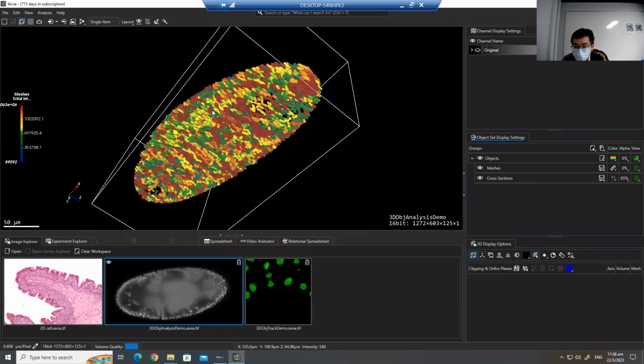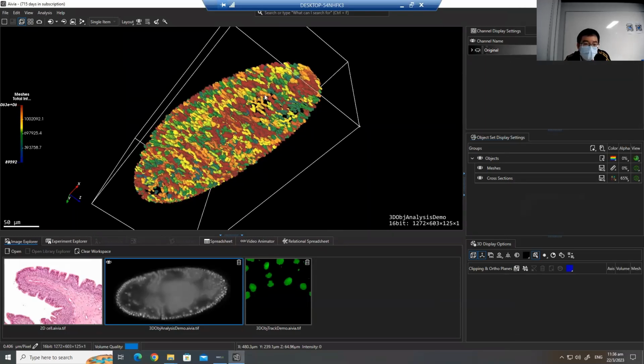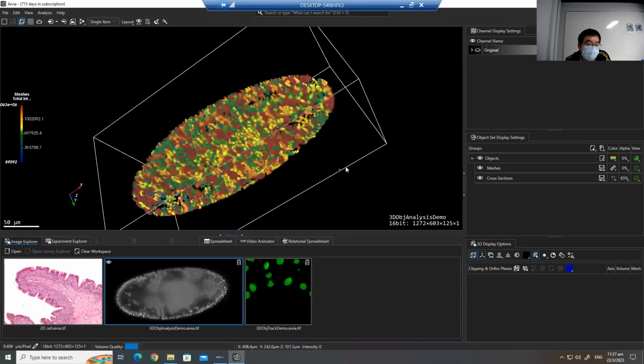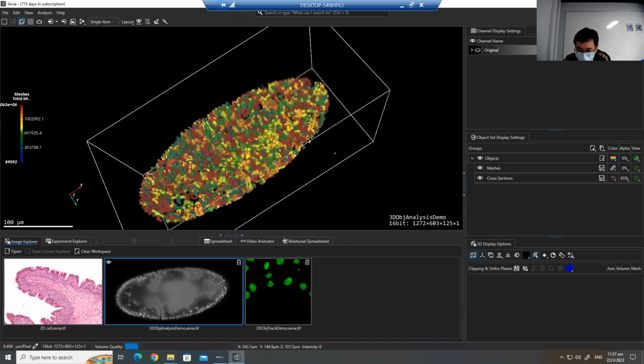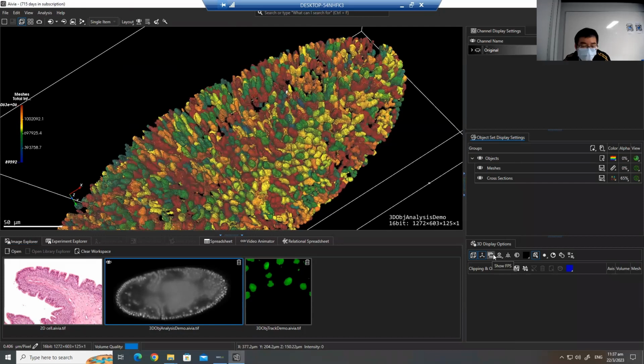And then we have more. We can do more with these 3D models. Remember that we can do 3D ortho scan and clipping with the 3D model. But after we have this 3D model generated, I mean 3D measures, we can clip not only the signal, but also the 3D model.